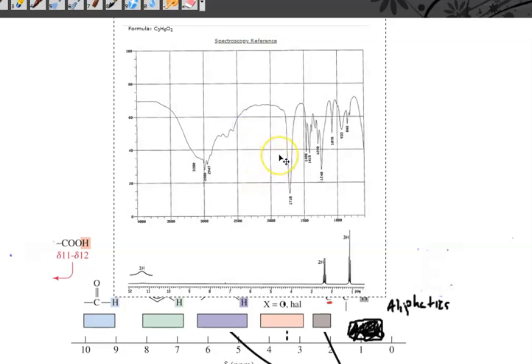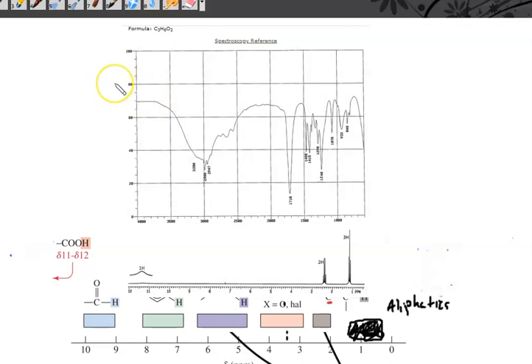All right. Okay, so because we did IR practice last week, I want to kind of get back to some IR practice. Here's the NMR down here. Hopefully you guys can see it. I'll blow it up a little bit bigger. But I wanted to keep this down here so you guys at least have this handy. Okay. This is offset. It doesn't tell me where. That's interesting. Oh yeah, it does. It's between 11 and 12. It's telling you that that's between 11 and 12. You can't see it. It's this little blob right there, but it's showing you that.